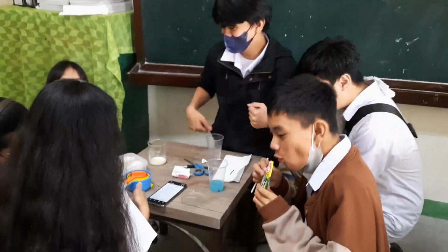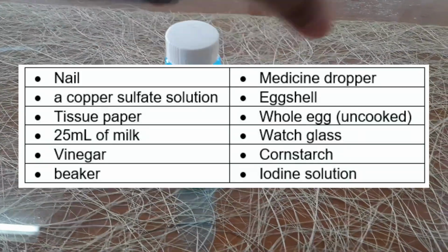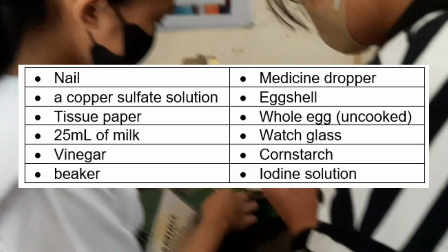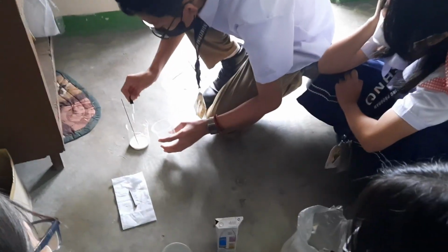For the materials, we're going to have the nail, a copper sulfate solution, tissue paper, 25 ml of milk, vinegar, beaker, medicine dropper, eggshell, whole egg, watch glass, cornstarch, and iodine solution. For the procedures, we will have 4 sets.